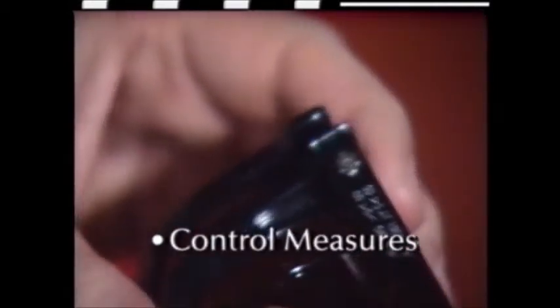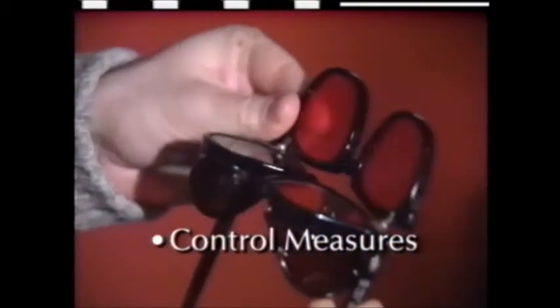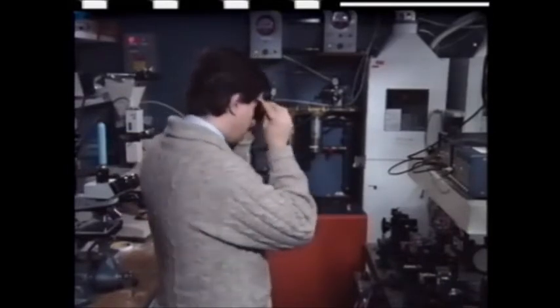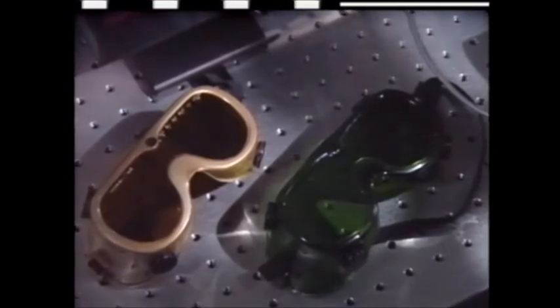Read the label on your protective eyewear carefully and be sure you understand which lasers it offers protection for. Be sure to select eyewear that protects you from all wavelengths produced by your laser. Do not select eyewear based solely on the color of the filter. The eyewear should be marked for your particular application.